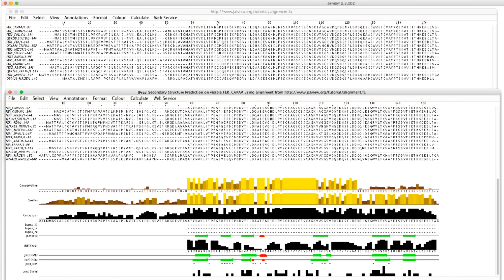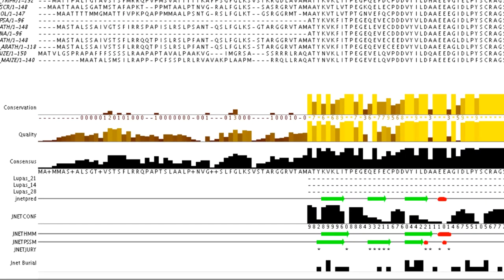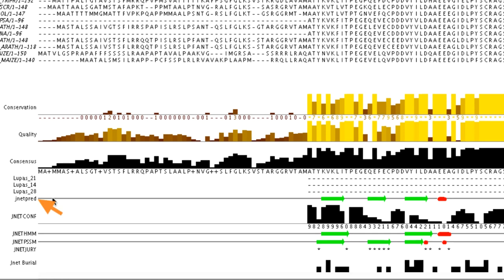Let us take a closer look at the JPRED annotations. The consensus JPRED prediction is displayed in a row called JNetPRED. The helices are represented as red tubes and the strands are represented as green arrows.